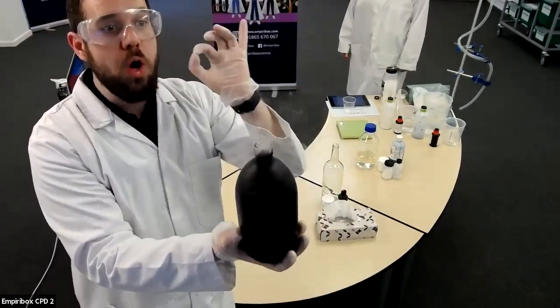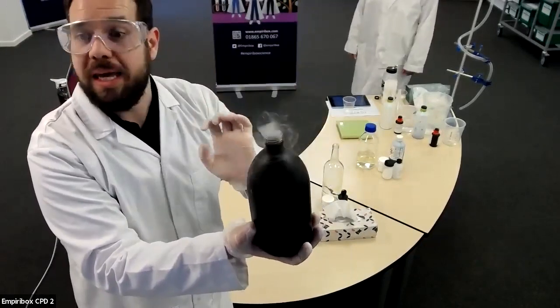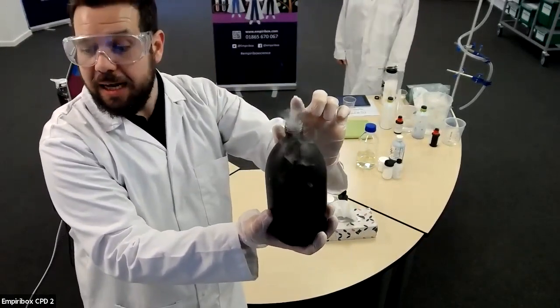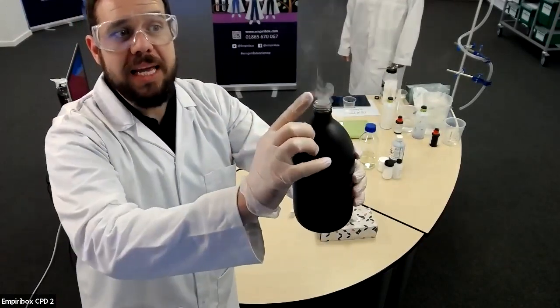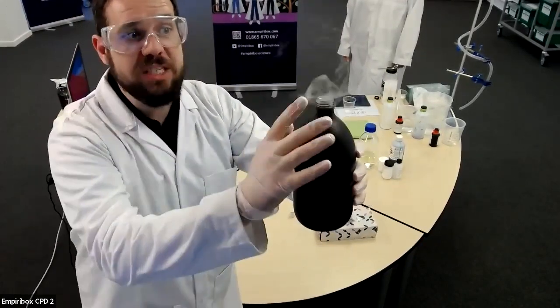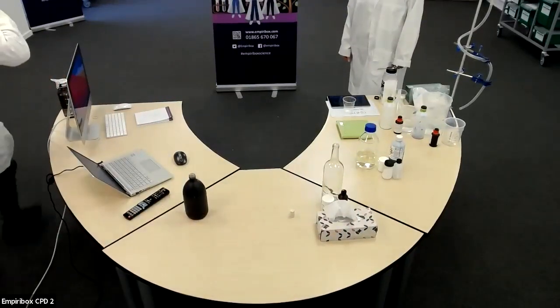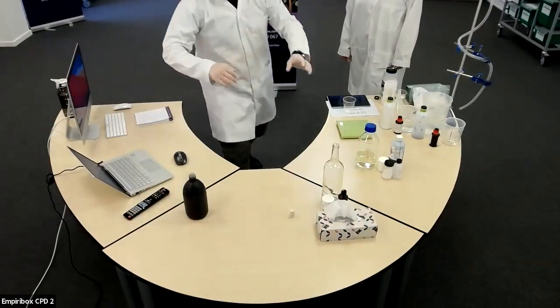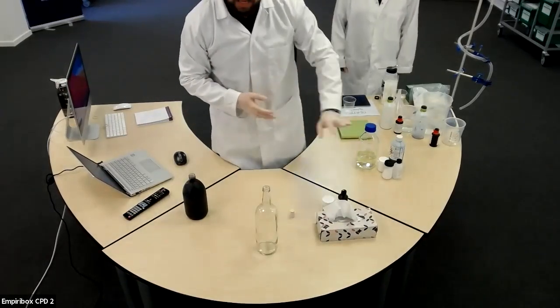So how do I know a chemical reaction is taking place? What was that key little factor that tells us a chemical reaction has taken place? That is all that smoke. That's what I can see there. Now, I can repeat this experiment again, but this time I'm going to show it in a clear bottle so it becomes a little bit easier to see.